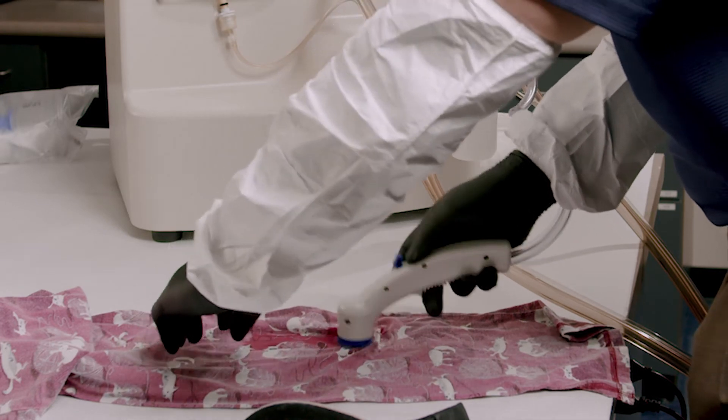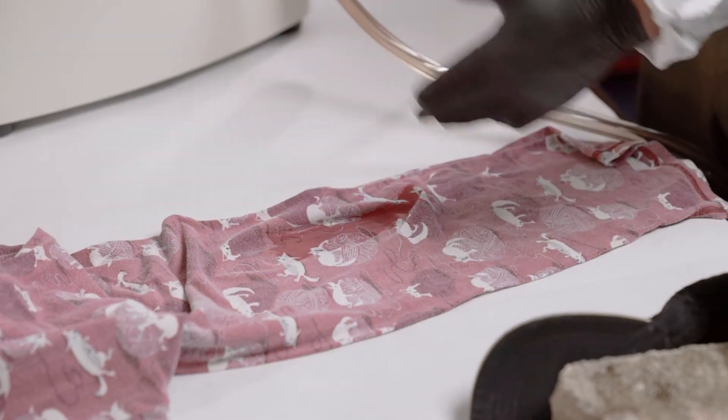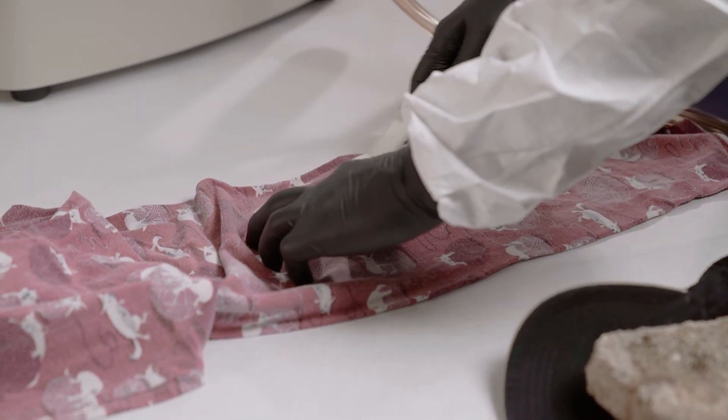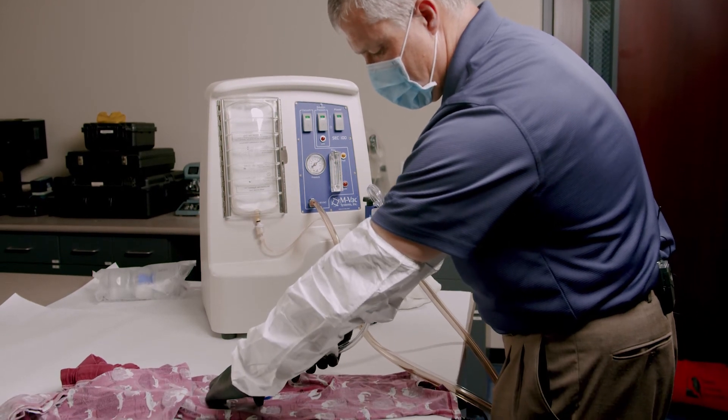You can always go back and do what's called a dry pass. A wet pass is when we're actually spraying the solution down. A dry pass is when you turn the solution off and just apply the vacuum pressure to collect up any remnants of liquid that might still be on the item.